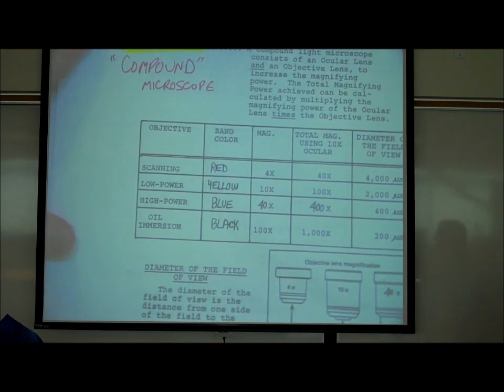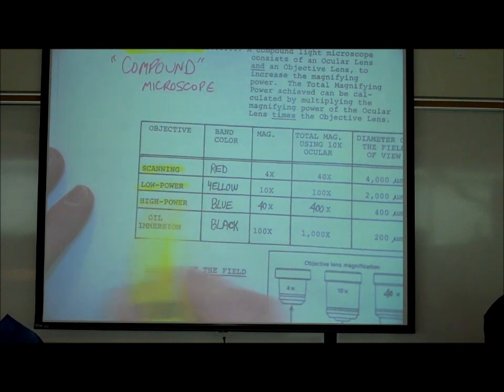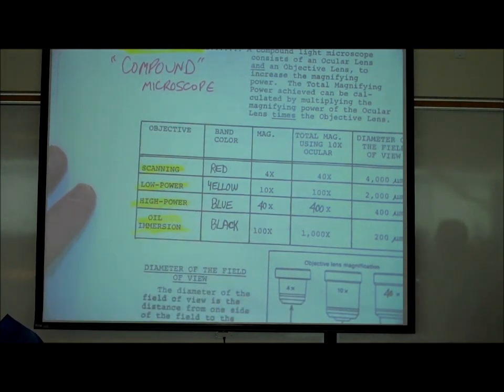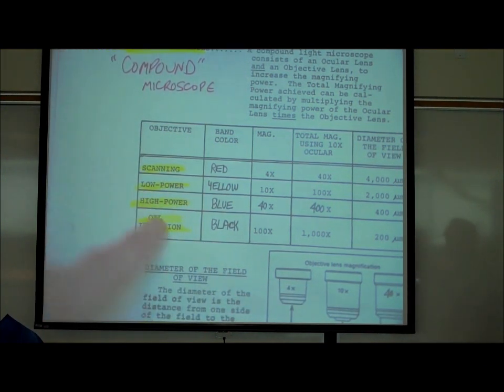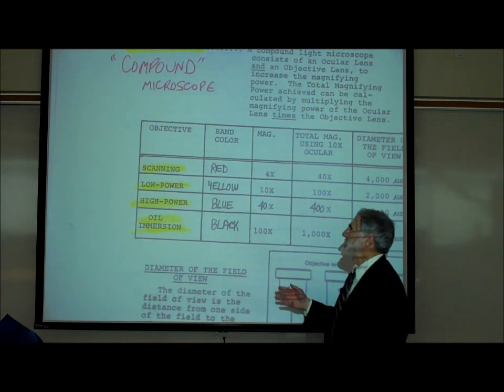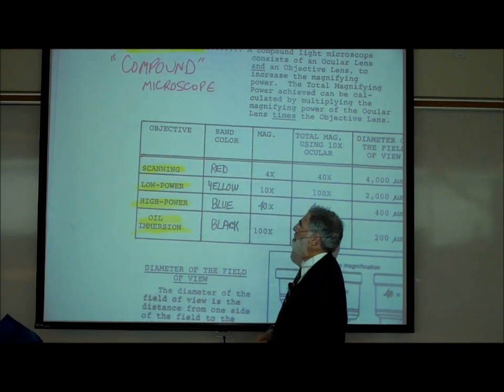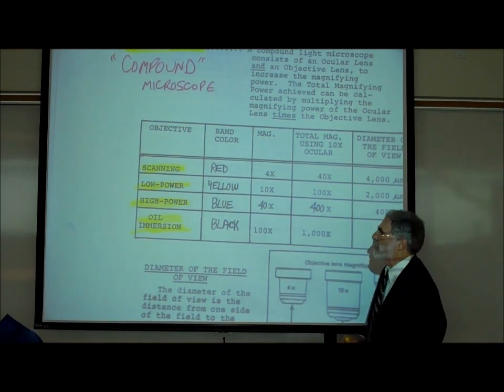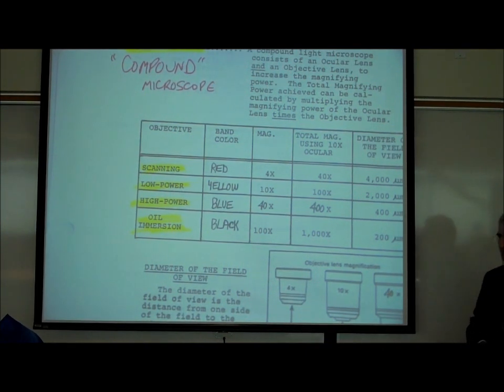There are four objective lenses: scanning, low power, high power, and oil immersion. They each have a colored band — scanning has a red band, low power a yellow band, high power a blue band, and oil immersion a black band.